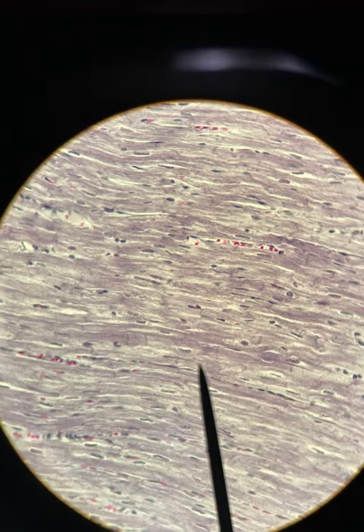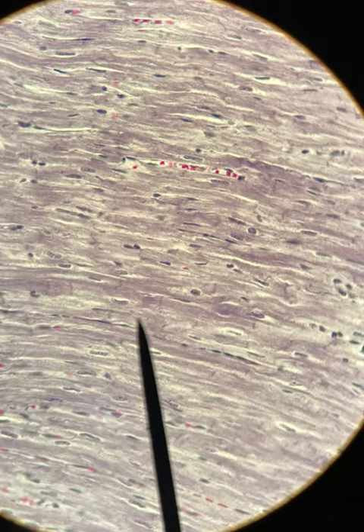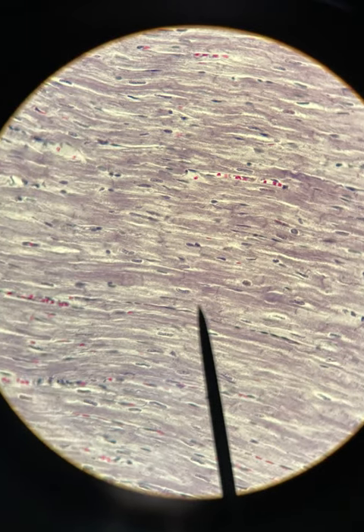And here is another type of muscle tissue. And this is cardiac muscle. And the way that you can tell that it's cardiac is the presence of these. These are intercalated discs. And they are these lines that run throughout the entire thing. You can really see them now that you're looking for them. But these intercalated discs, they act like staples. And so they're going to allow this cardiac muscle, which is only found in the heart wall, that's the location. So cardiac muscle is found in the heart wall, and this allows your heart to beat in unison, which is very important. Otherwise, you would be having a heart attack.